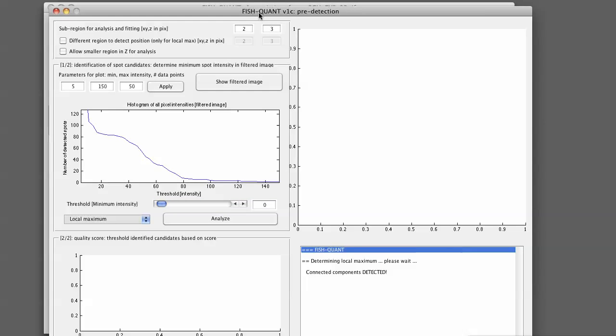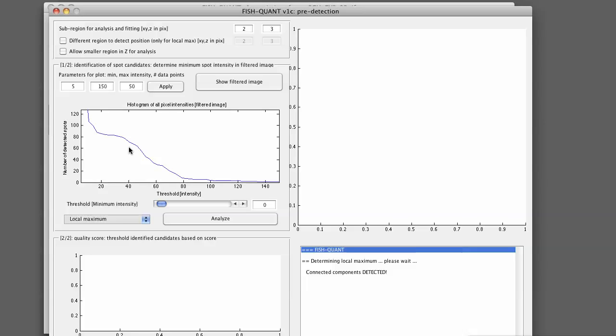The first interesting plot that's shown down here is now a histogram where here you have an intensity threshold that will be used and here the number of detected spots. So basically this is a number of different intensity thresholds. You can say a spot has to have at least intensity 40 and then you can check how many spots were detected.